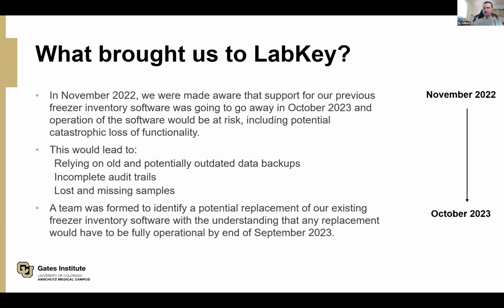Our audit trails potentially would be incomplete and we wouldn't know what has happened to certain samples, and we could have lost and missing samples. For anyone who works in an LN2 freezer, you know how frustrating it is to open a box and find that a sample you think should be there isn't, or that you have the incorrect sample there, because then you really have two samples that are misplaced in the system.